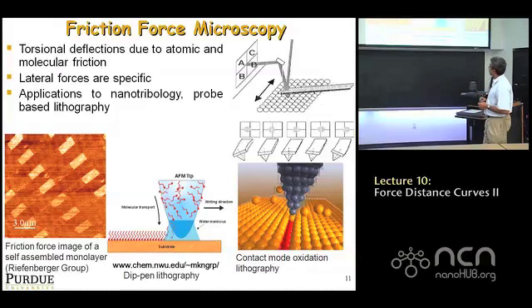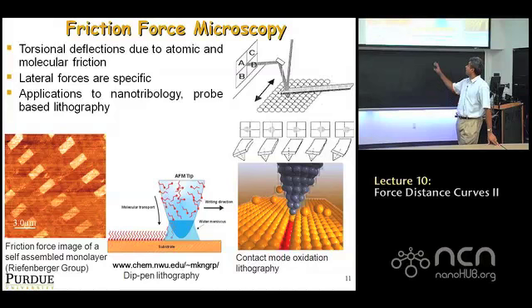For example, on the bottom left is an example of self-assembled monolayers that are stamped on a surface. These monolayers, the ones in white, are monolayers of molecules. They're probably a nanometer high. They're very soft, so if you did a topography image, you would barely see these rectangular pads on the surface, because they're just 1 nanometer high and they're soft and sitting on a hard sample.